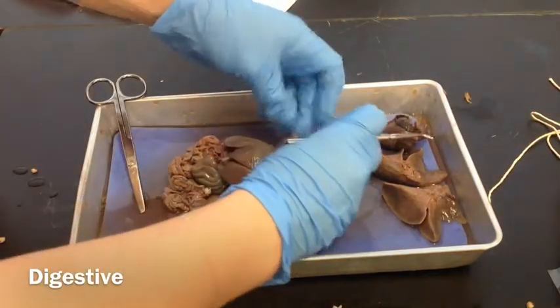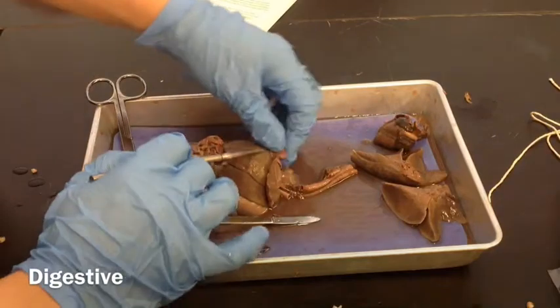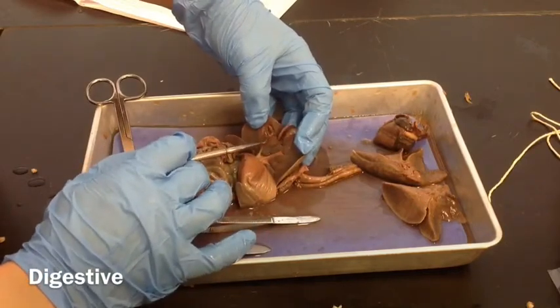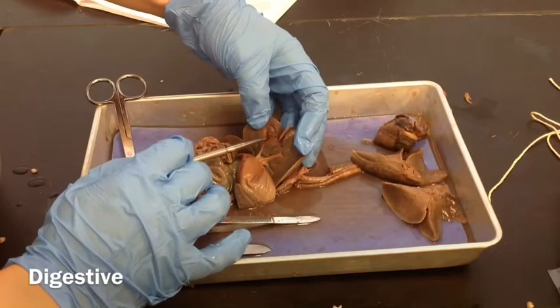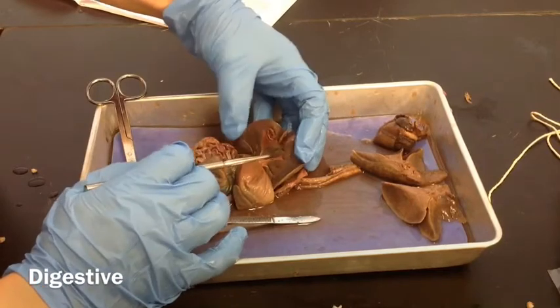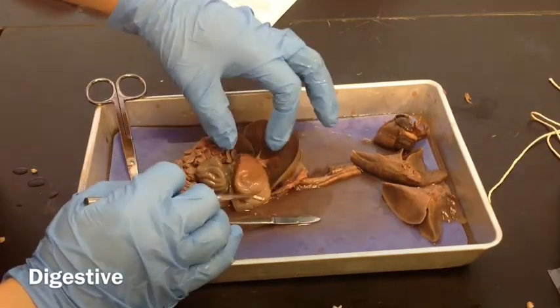This is the diaphragm again, and right underneath the diaphragm lays the liver. The liver is this large, lobed organ here — it has several different parts. It's underneath dorsally. Underneath it there's this little sack, and this little sack is the gallbladder. It may be a green color; mine's a little bit red, but that's the gallbladder. This large sack here is the stomach.